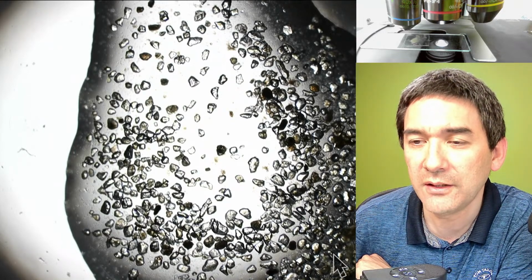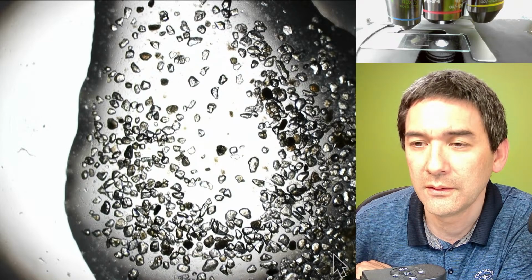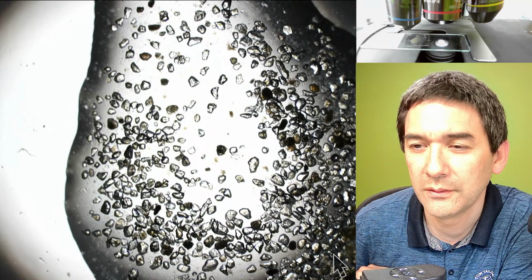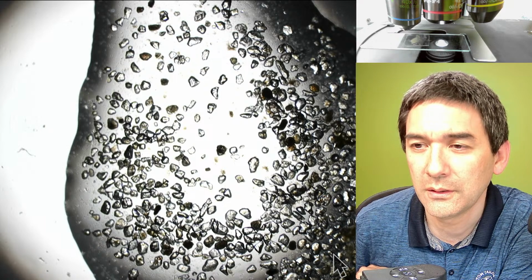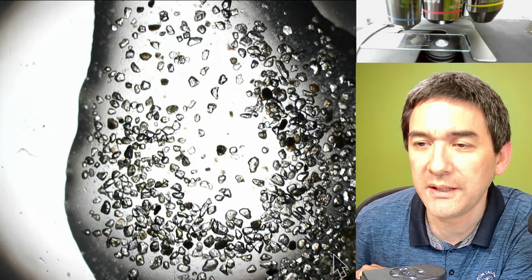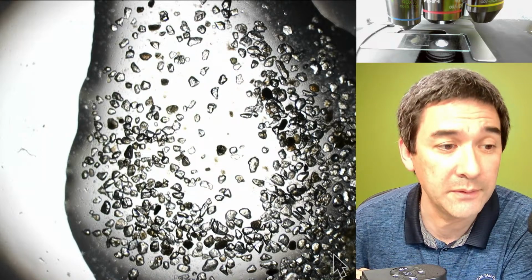So I'm scanning through the questions again. Micropipette capacity. Oh, gee, I overlooked it. Okay, you found some mounting medium here. Some emailing issues. Did you keep the sample wet or did you rehydrate it? No, I kept it definitely wet.